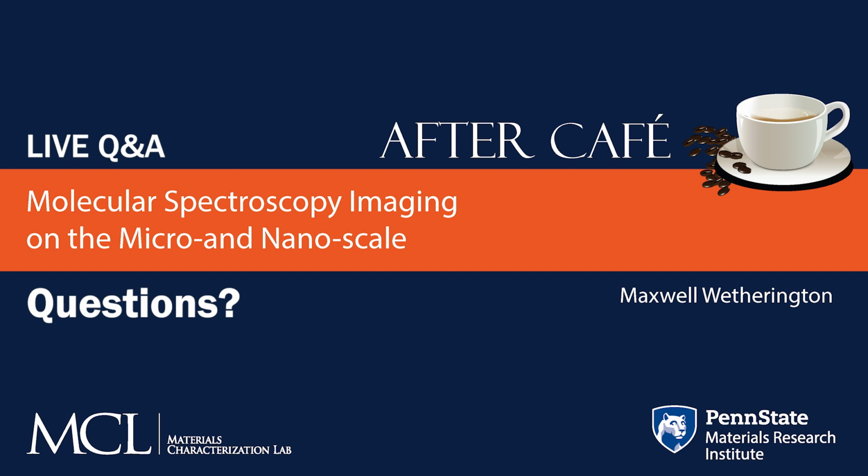So if I had particles that are a couple hundred nanometers, what would be a way to prepare these to do Nano-IR? I'm interested in just what they are, not contamination, but atmospheric chemistry or some other nanoscale additive, with average particles of 400 nanometers, just to make it up. What would a prep look like for that?